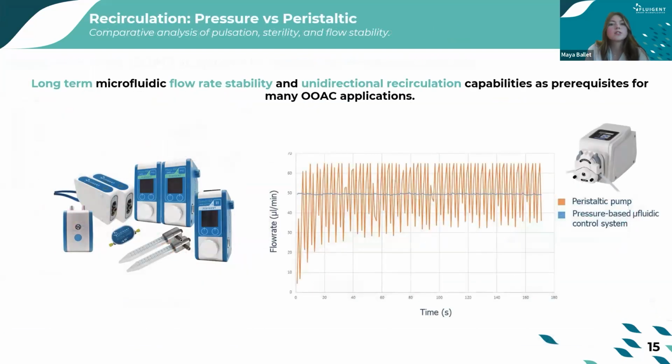So different technologies exist. Here we are comparing two main technologies, the peristaltic pump and the pressure-based flow controller. The different technologies all have their advantages and disadvantages.